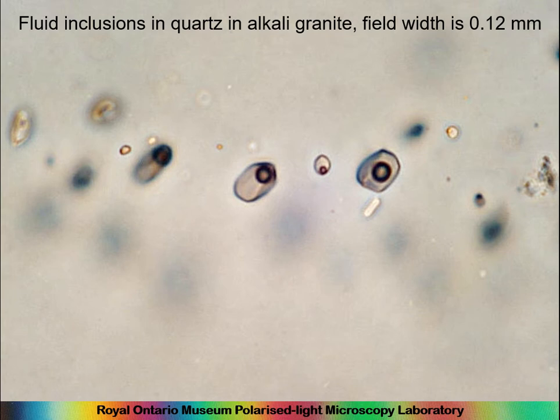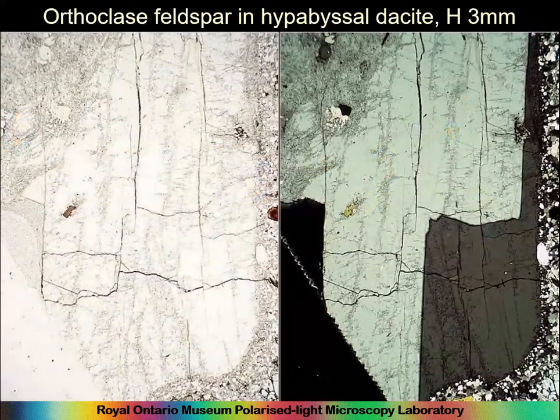And as I mentioned in an earlier lecture, this is because quartz is the last mineral to form once a melt cools and solidifies. And so anything left, like a fluid, would be left within the quartz. So that must be quartz.